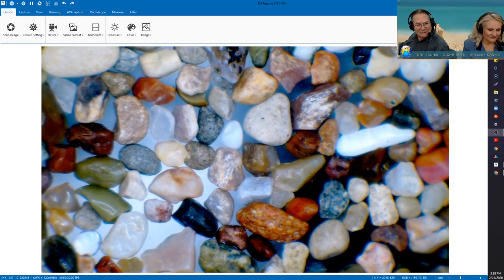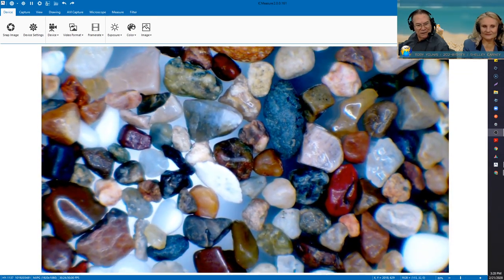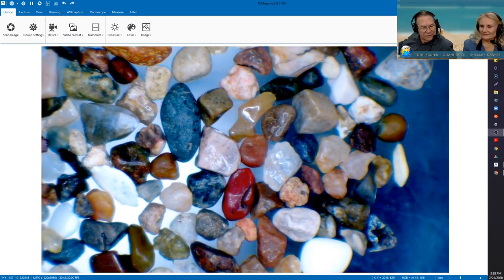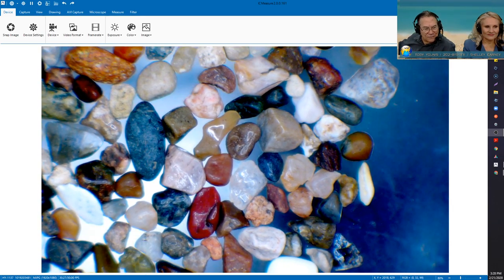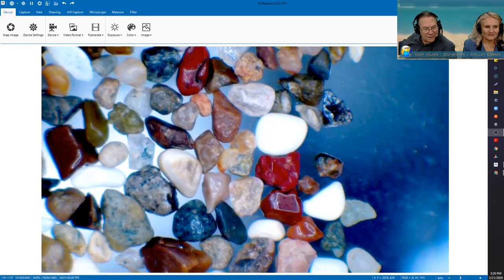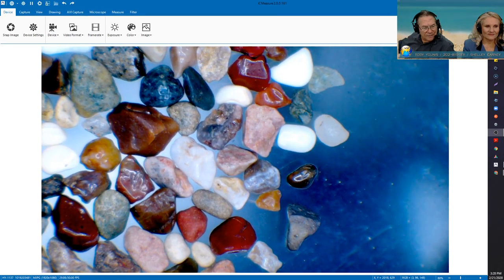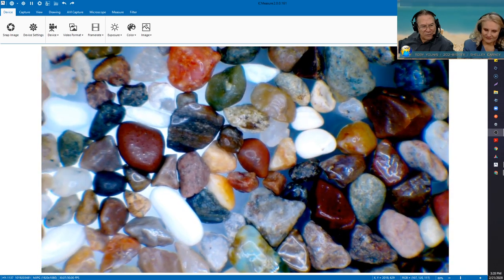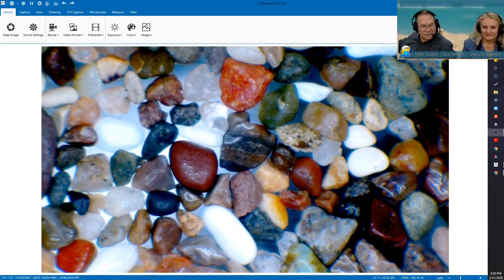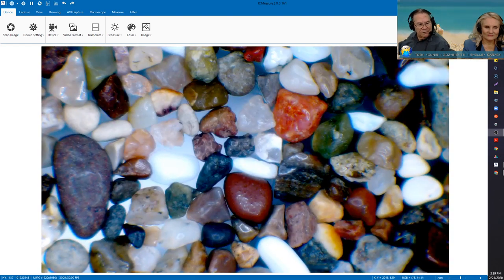Yeah, lots of rocks. I wanted to see if I could find, so it's hard for me to tell if that one in the center right there is actually, yeah, it's not quartz. That's a shell fragment. But like I said, there is some angularity. I'll call it sub-rounded rather than angular because most of it's smoothed off. It's been bouncing around at the bottom of the seafloor there. Oops, that was my fault. I keep banging that.